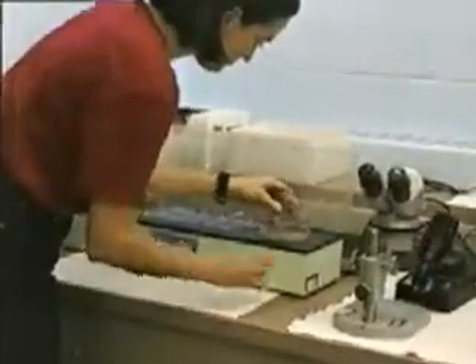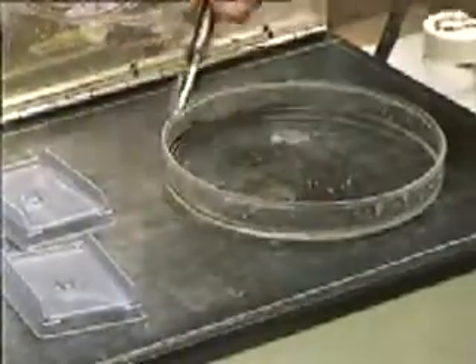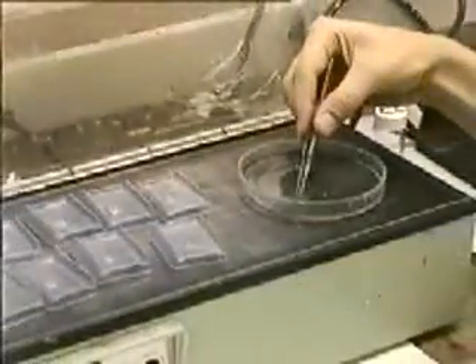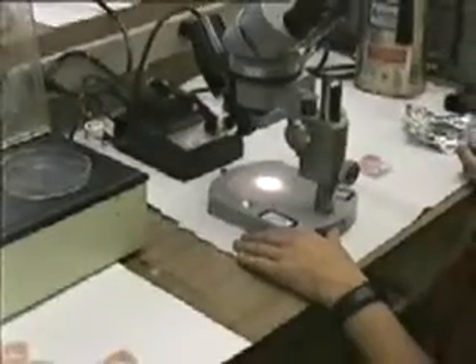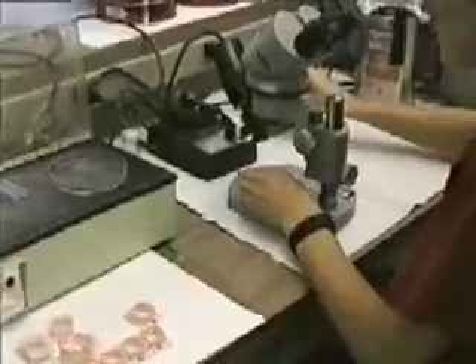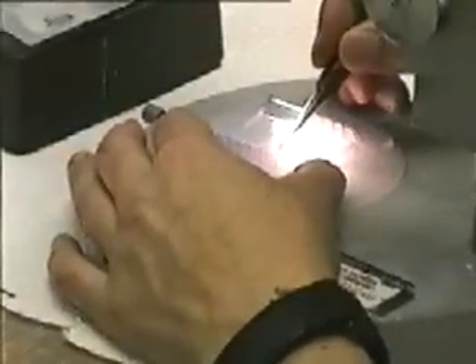Individual specimens are then selected and transferred singly into the molds. The molds can then be examined under a dissecting microscope where proper orientation of the specimens can be made. This allows for later sectioning to represent a particular plane of observation.